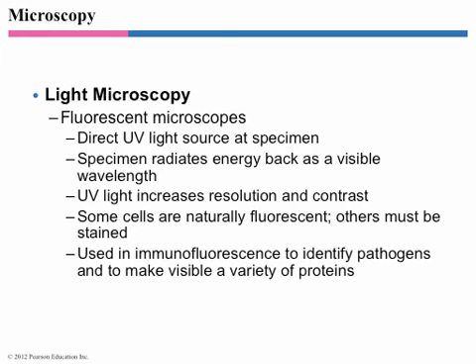And there will be specific fluorophores, dyes, molecules, potentially labeling particular parts of the cell that are inside and that will glow when they're hit with the right wavelength of light, and that they will glow a different color. So you're hitting it with blue light, and then you have things inside of it that are going to emit red, and you'll be able to see the red light because it passes the filter.